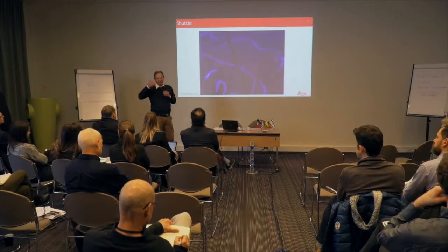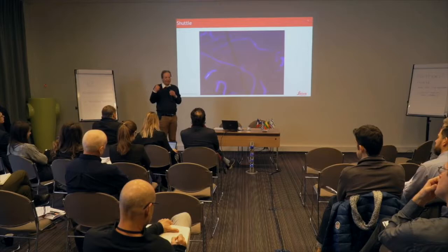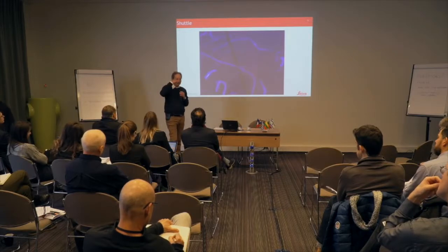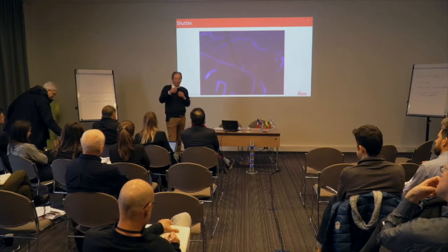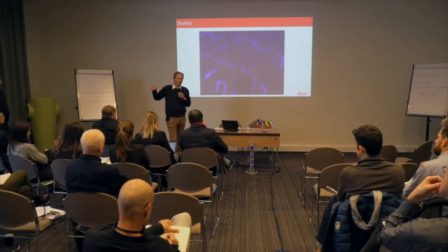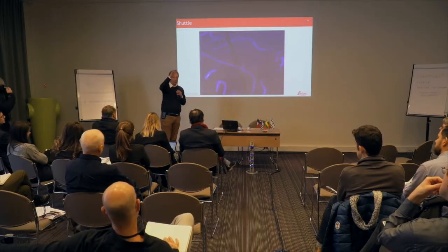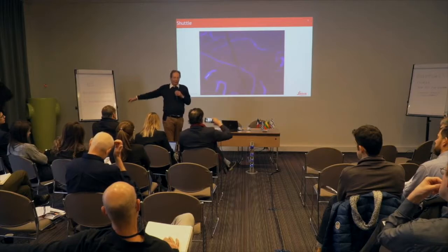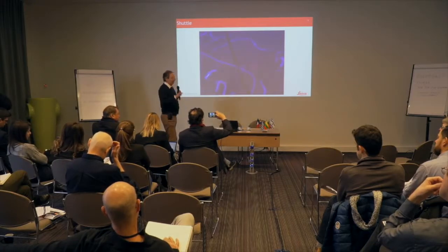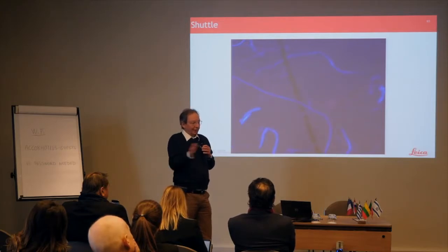I haven't yet talked about the spectroscopy part because I still believe that this doesn't really make sense in a scan world, because you should then choose the parts that are really interesting for spectroscopy and do that separately, as you said you would do Raman and these kind of things separately. I still believe that the spectroscopy part should be taken out.